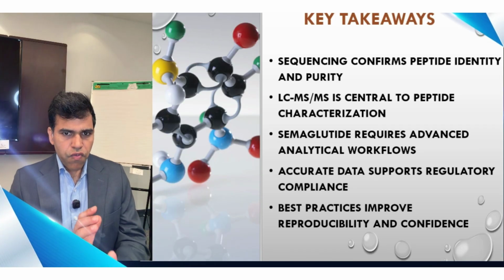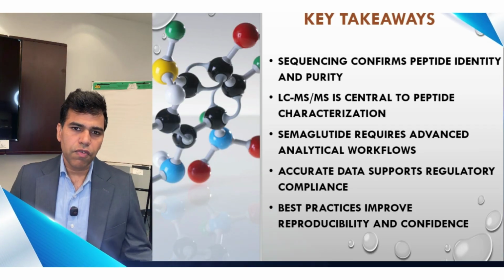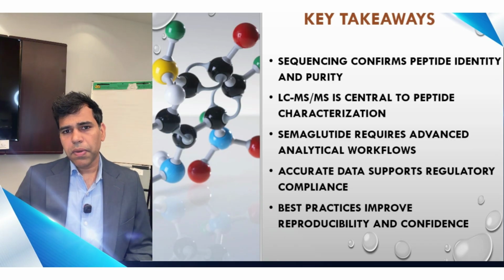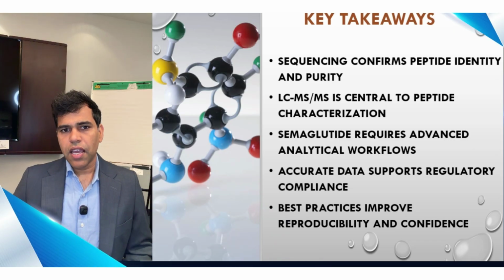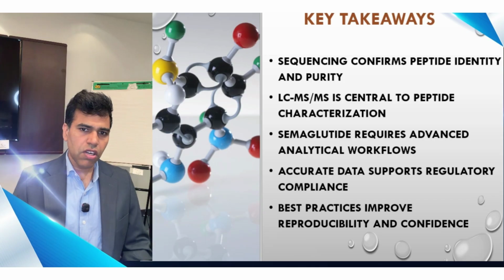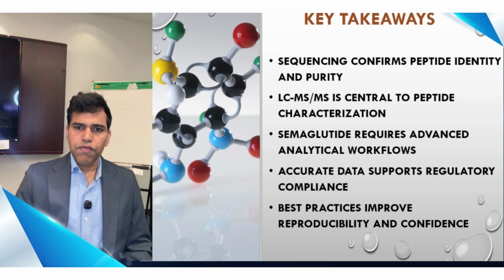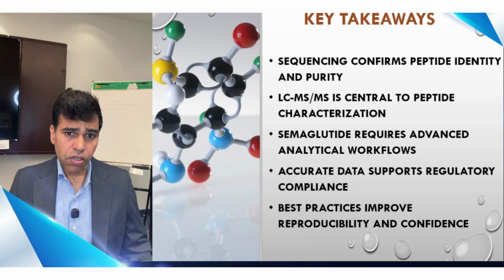Here is what a well-executed sequencing workflow ultimately delivers. It confirms peptide identity and purity with structural evidence, not assumptions, not inference from synthesis records.